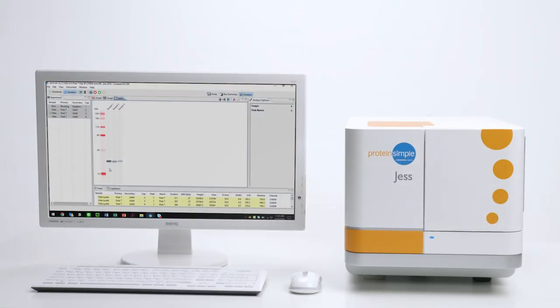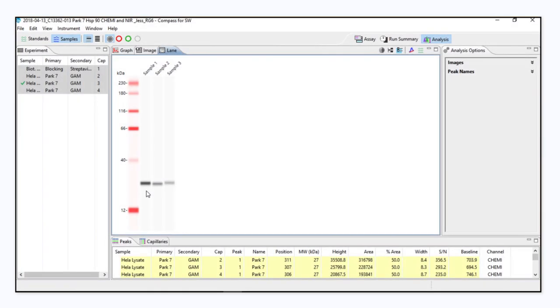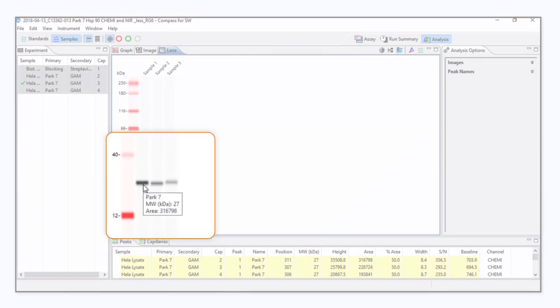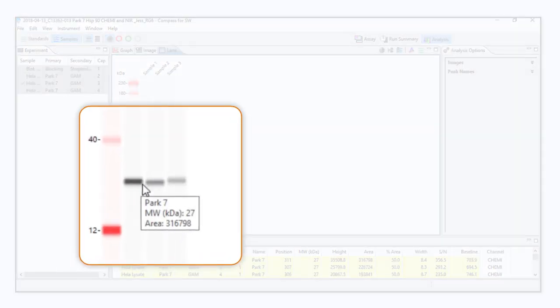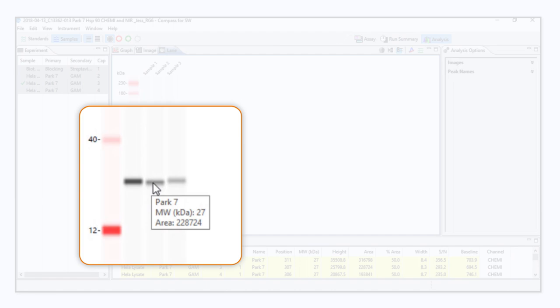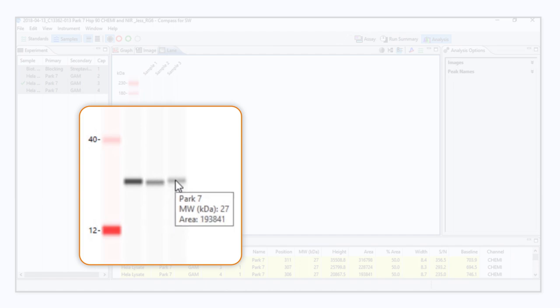Analysis is a breeze. Want to identify whether a protein is present or absent? Jess gives you the qualitative Western blot data you are used to seeing.